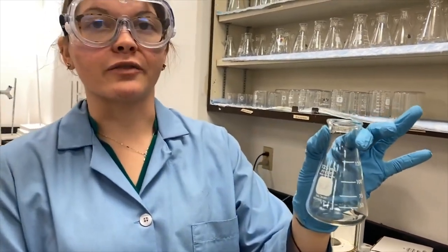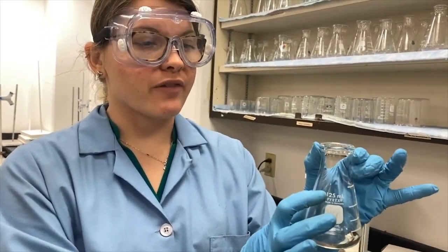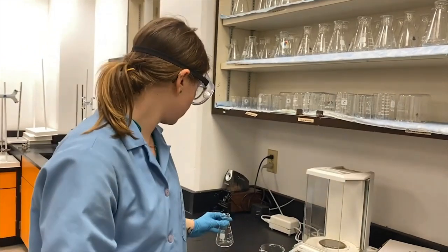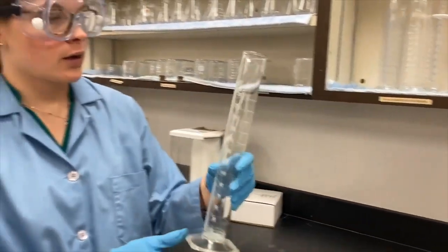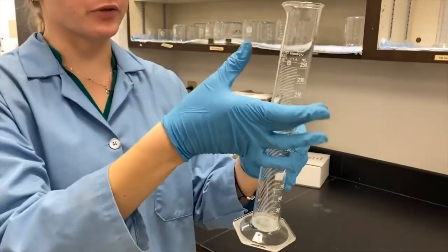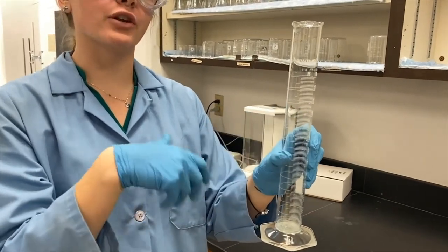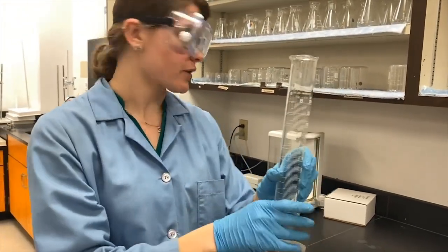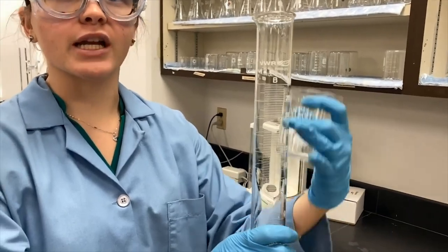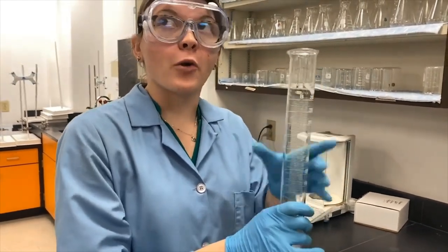This is going to be an Erlenmeyer flask — we know that because of the shape. It's kind of triangular. This is a 125 milliliter flask and it has graduations every 25 milliliters. This is going to be a graduated cylinder — a tall cylindrical shape. This is analytical glassware because it has more graduations and is generally going to be more accurate. The beaker is a little more general, while the graduated cylinder is made to be more precise and accurate, and that's what we're going to be testing today.